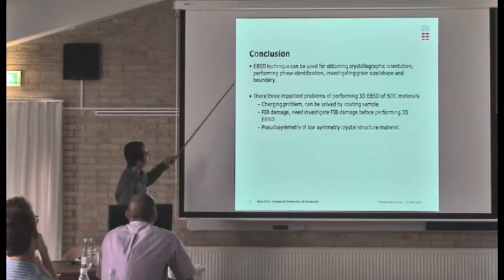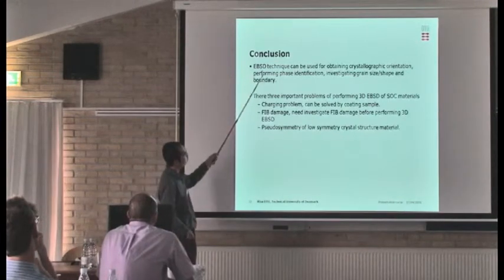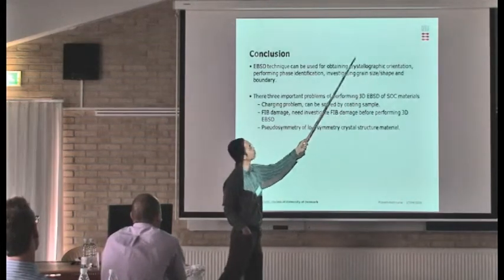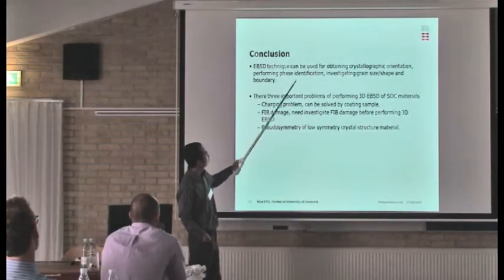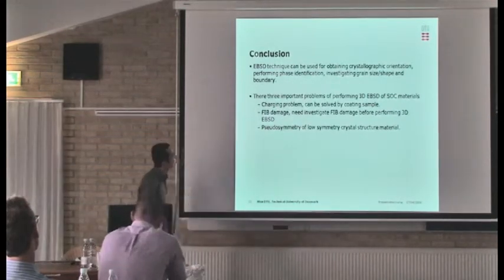That is the conclusion. The EBSD technique you can use to measure orientation of crystal, and also can do phase identification and investigate grain size, shape, and boundary.